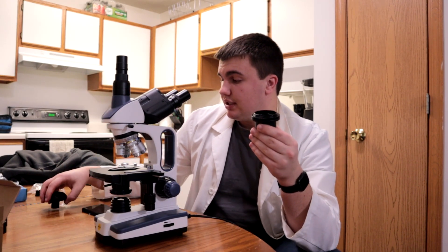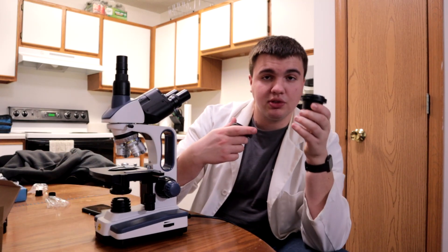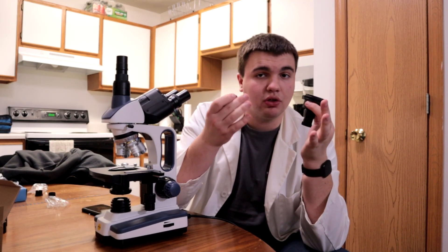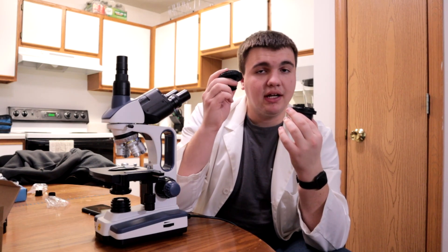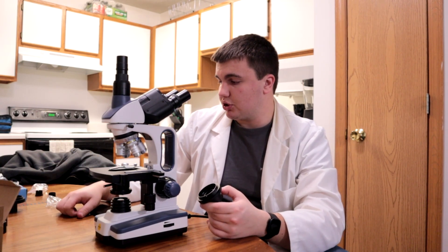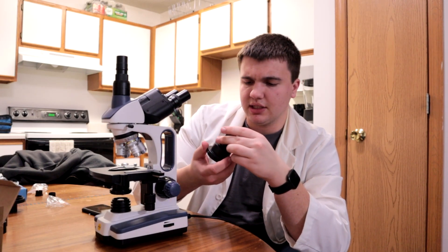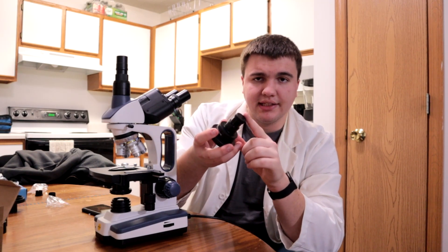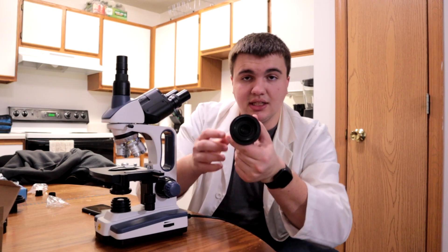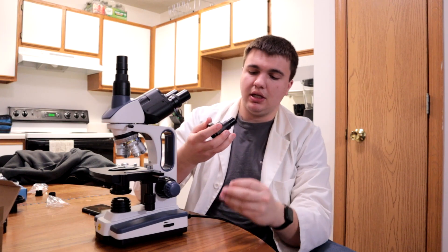This was $120. This other one, I'm pretty sure, was pretty cheap. So if this can do something better than that — and it does have two times power — maybe there will be an improvement. If there's no improvement, I'm going to send this back, get my $120 back, and recommend the other one. So this is the whole thing. It's nice, solid metal. It does unscrew at one point. There's a lens cap here, no lens cap on the other end, and you can still see the lens down in there — which is less than ideal. I would like to see a cover for that. Lens cap pops off, there's your lens, and it should just stack the camera on and we're ready to go.